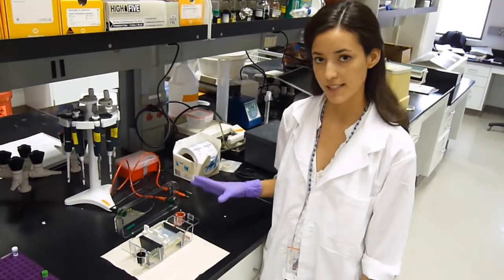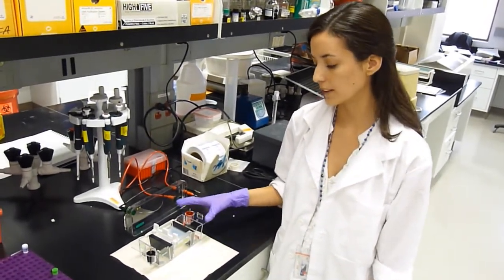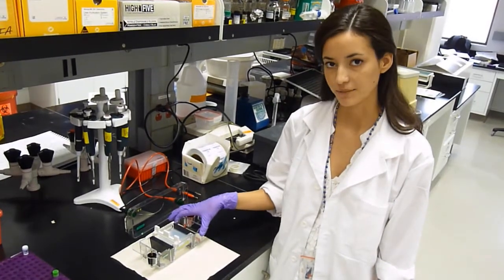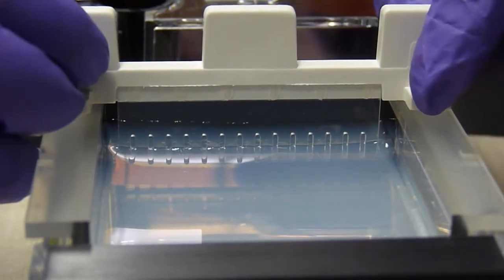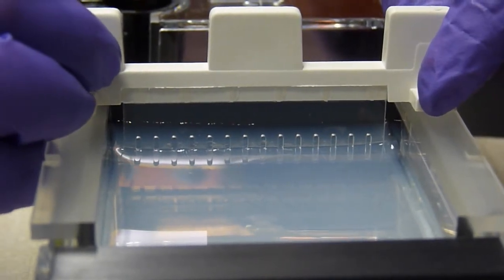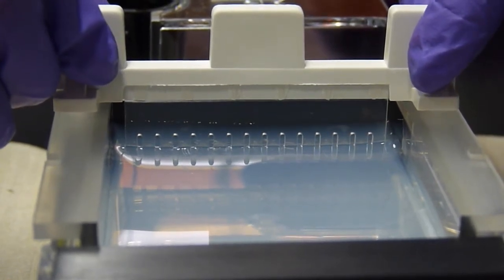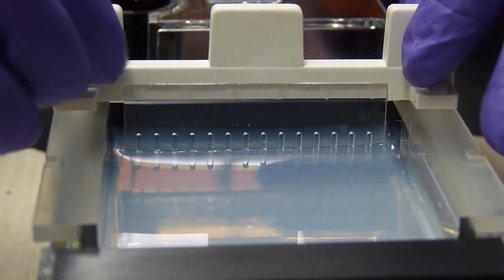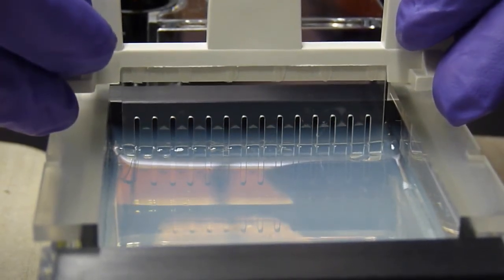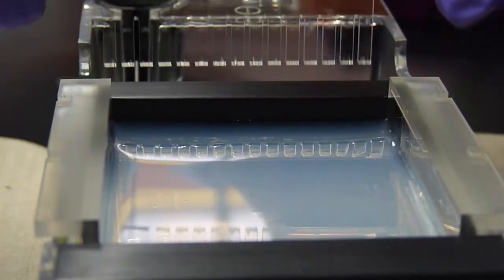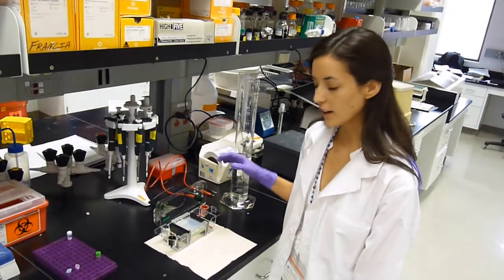It's been about 20 minutes and our gel is set. The way you can tell is that the gel turns from a clear liquid to an opaque colorless solid. And now we're going to take out the combs. Be very careful when removing your combs. You don't want to tear your sample wells. Just lift vertically. You will feel some resistance, but keep pulling.